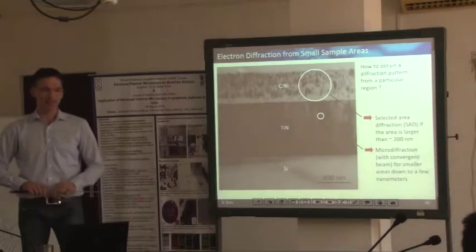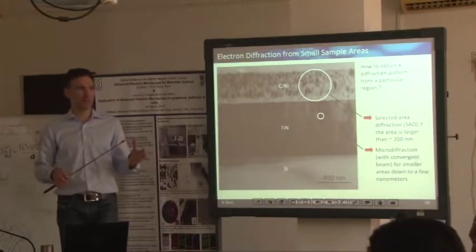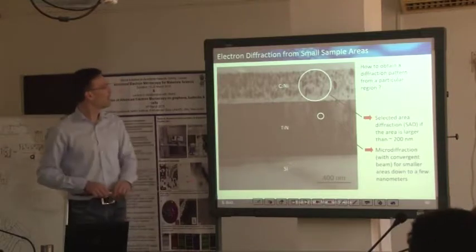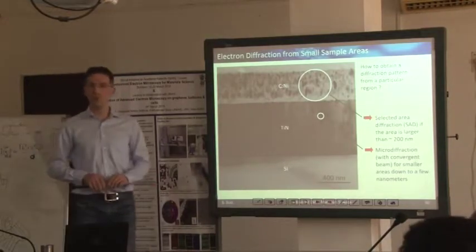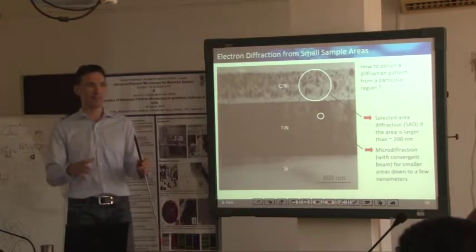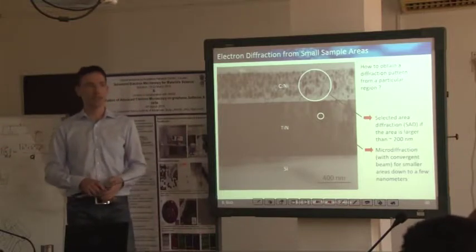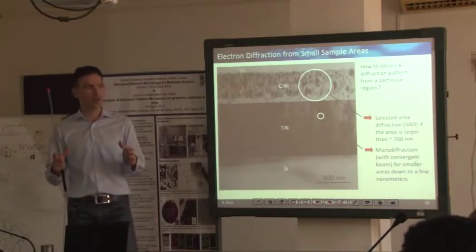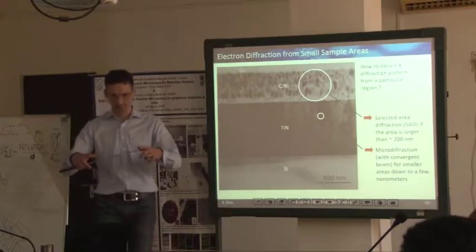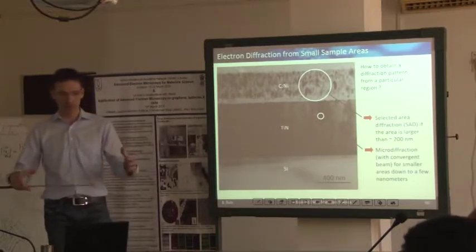This was a diffraction experiment of a semi-crystalline material. But in principle, you would like to define the region of interest on your sample. Even for such a semi-crystalline diffraction pattern, you will use a selected area aperture to define that region to a certain size of a few hundred nanometers or 1 micrometer.